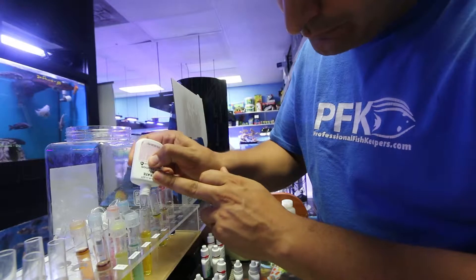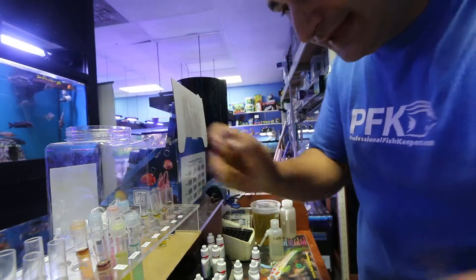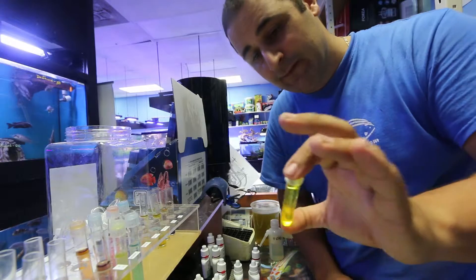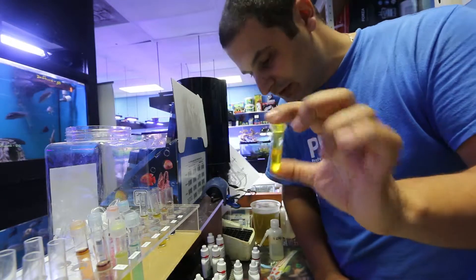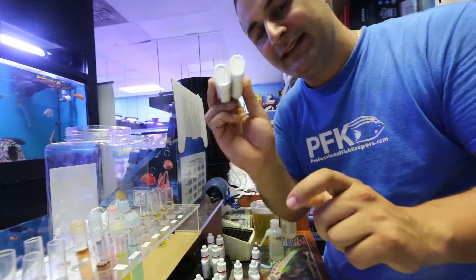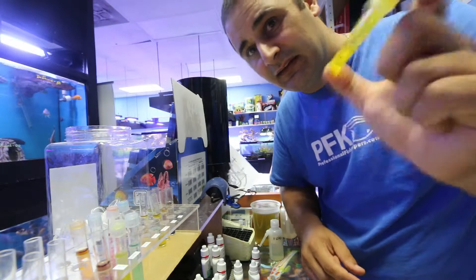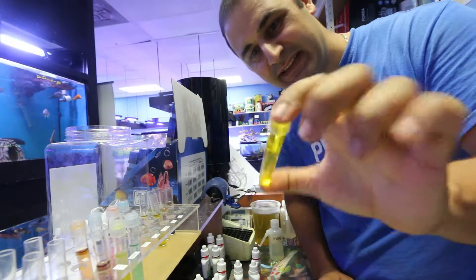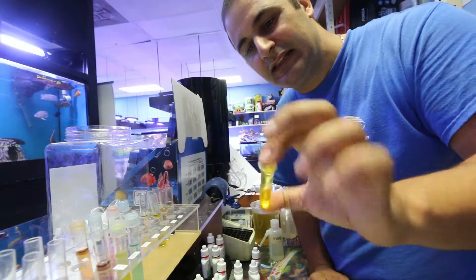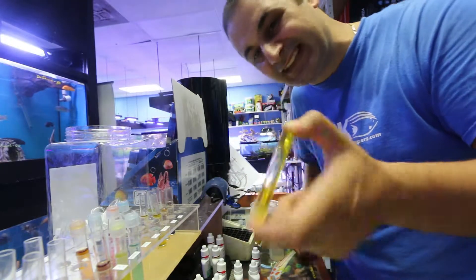For nitrate bottle two, shake for almost a minute, then let it rest for five minutes before comparing the color. A very common mistake people make is not shaking the nitrate test enough — you have to shake this one very, very well, vigorously mixing it back and forth. After about 30 seconds of mixing you'll start to see the tendency of what the end result will be.